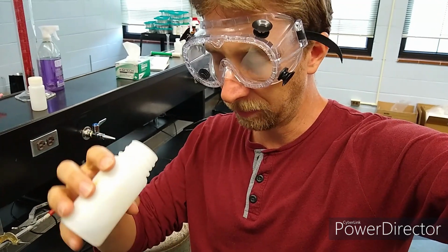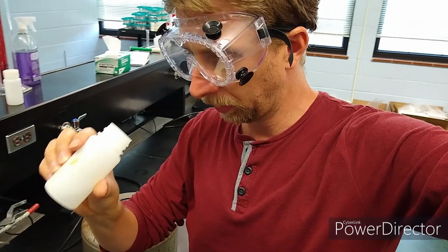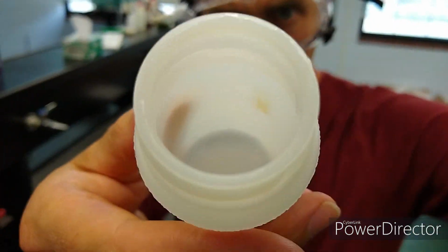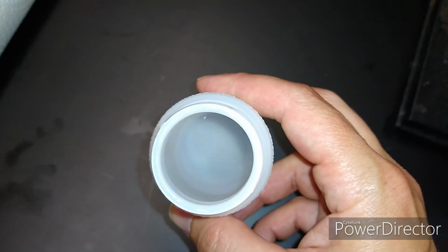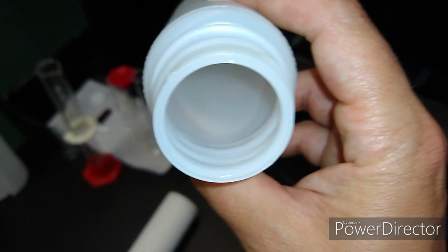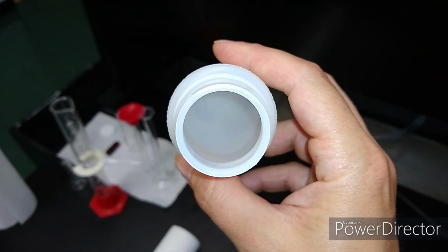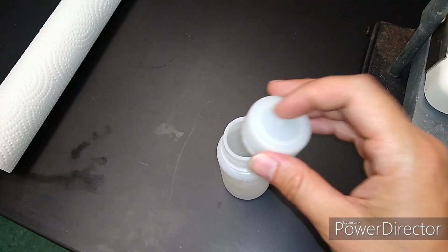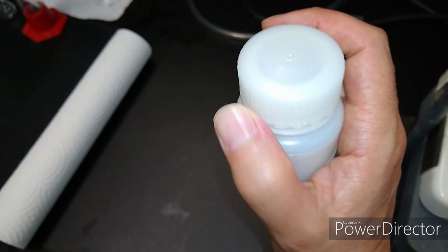If it's got a cloudy, milky white substance, then it's probably not going to work. You see anything in there? It looks pretty clear to me. I guess I should pour it into a glass container to look at it more carefully, but I'm going to say it's probably good. That'll save me a lot of time having to mix up a new starch solution.